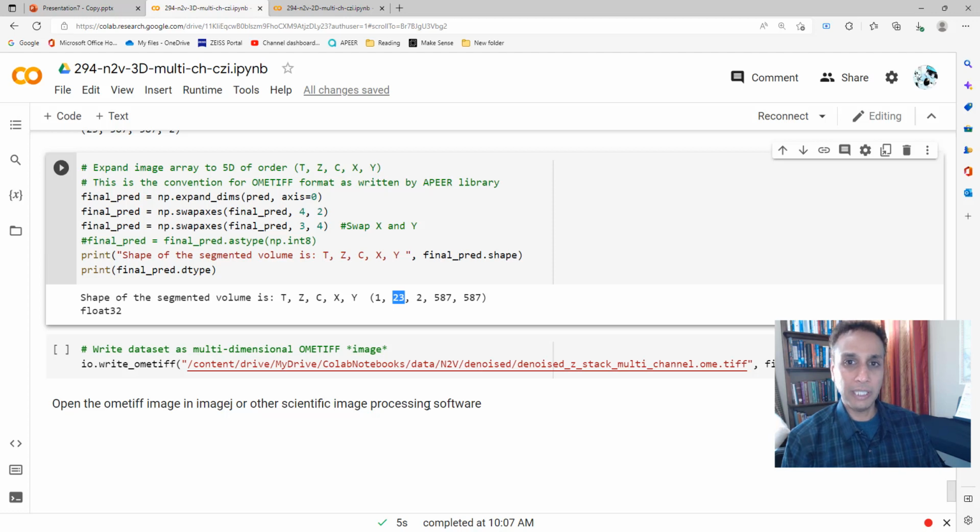I hope you really learned something in the last 3 tutorials, which is that Noise2Void is great for scientific images and also for non-scientific images. Go ahead and try it out. It's a great deep learning based approach that doesn't require you to have ground truth. It works only on the training images, and that is the best part of this. If you have actual ground truth, like for every noisy image you have a clean image, then Noise2Noise is probably a better approach because you have more information about your image. So other approaches may actually work equally well, if not better. But if you have no other alternative, only noisy images, this is an amazing approach.